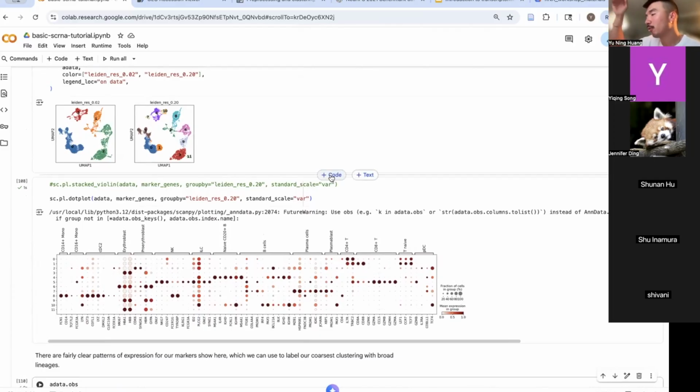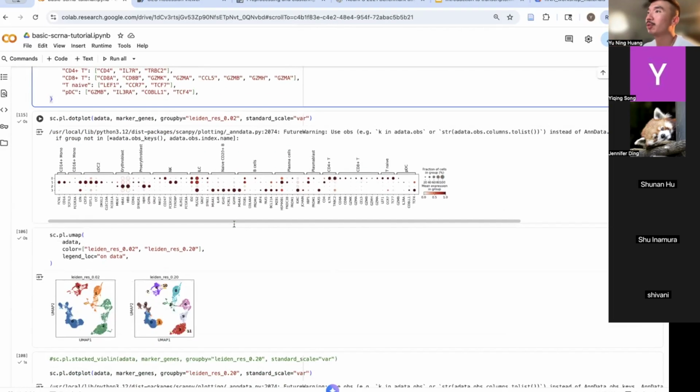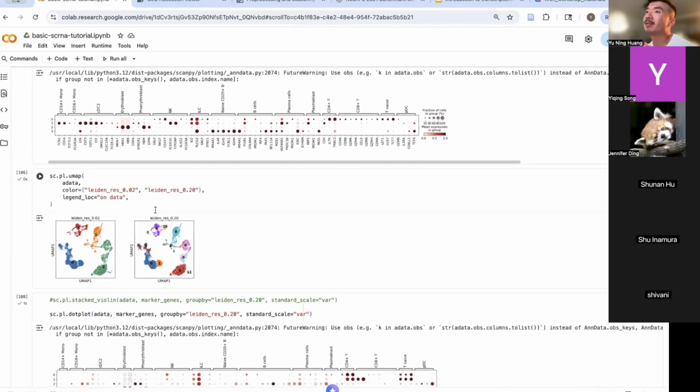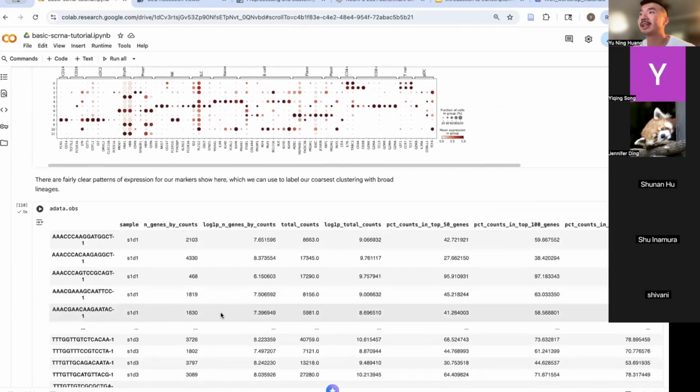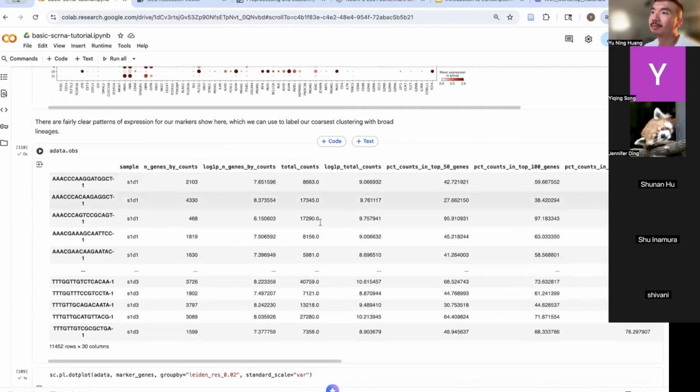So if you reset the quality threshold, you need to redo everything here. Re-identify, rerun the marker genes, and then manually identify the clusters again, because cluster zero for this number of cells will not be the same cluster for a different number of cells.